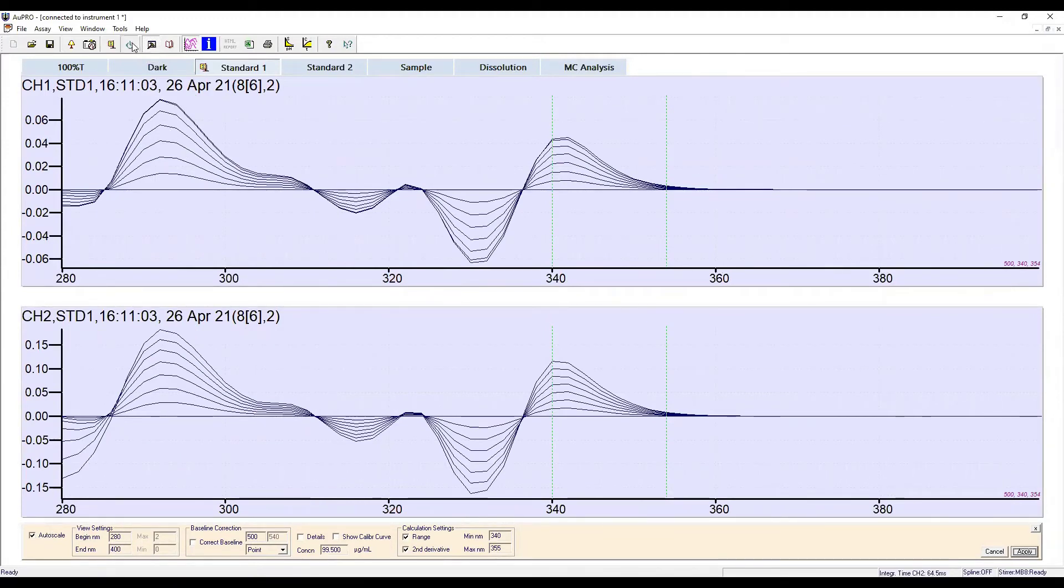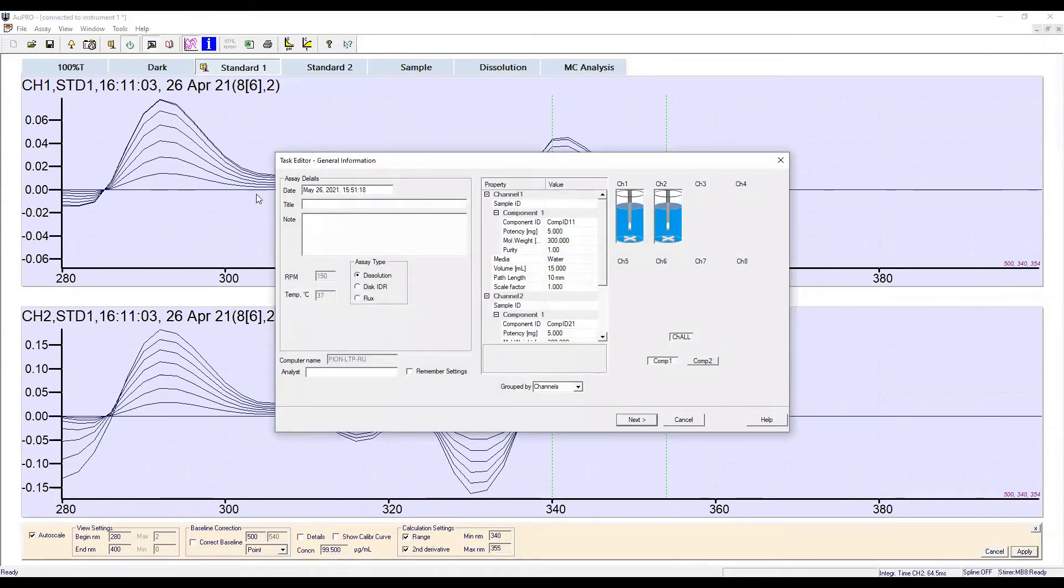The run stop button is pressed to bring up the task editor. From this window, we can enter details into our sample model. The assay is given a title, and the flux assay type is selected.